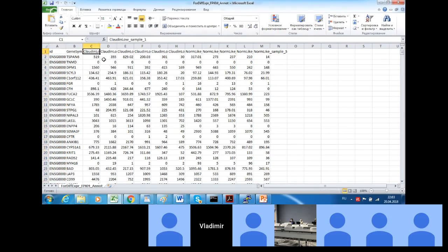So let's try to do it together just to see that the task is really simple. So first, let us transfer all this data to logarithmic scale. It can be easily done in multiple tools, in R, for example, if you like coding, but even table processing tools such as Excel give us everything we need.